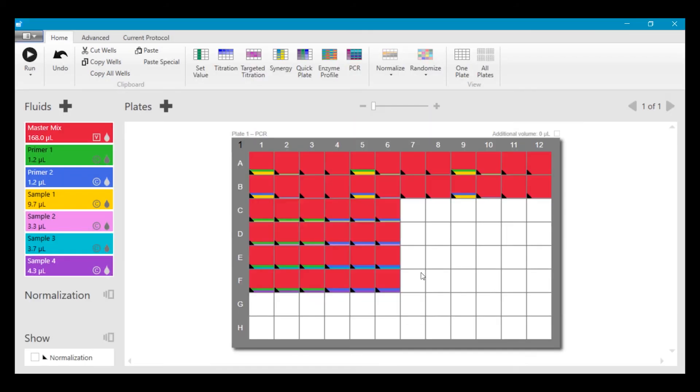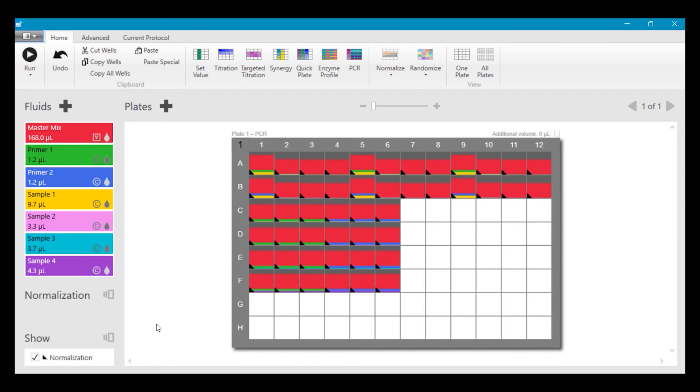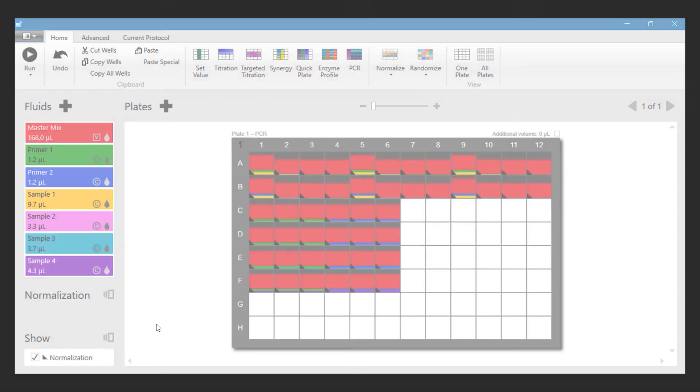Now we're finished and we set up the plate. It's normalized. It has all the fluids laid out on it. And if we want to show how much normalization is in each well, we can click the show normalization down here, and the normalizations shown in gray. Now you've set up a full plate using four samples against two primers with standard curves for a qPCR example.